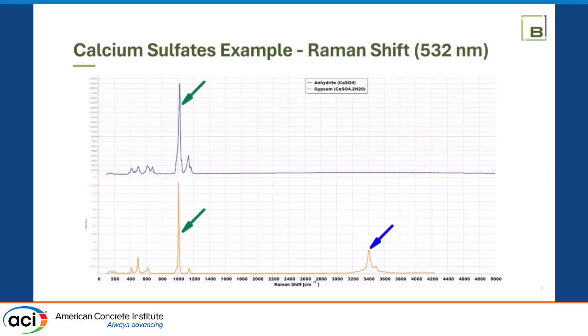And why does Raman work? Because Raman does the exact same thing. It tells you over there, the green arrow is sulfates are present. Water is present. So you can do some rapid identification of what's there. In these 2 examples, the analysis is like 60 seconds. You get that scan, and to get that information in that time frame is great.